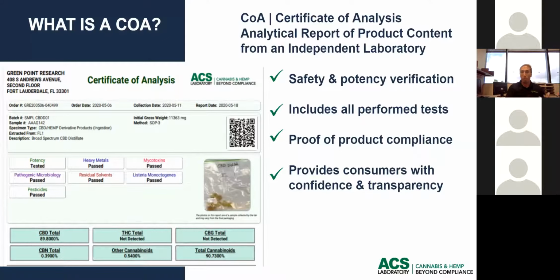It's your way to prove that your product is compliant, that it's below that 0.3% THC, that it's true to the label claim, that what you're saying the product is, is what the product truly is. And it also is a great way to provide your consumers and customers with that confidence and transparency to know that your product is true to what you're saying it is.